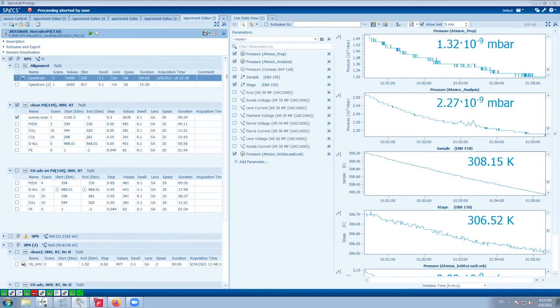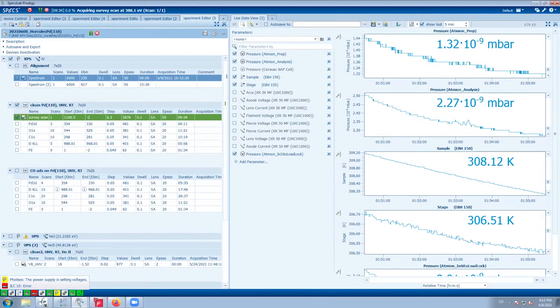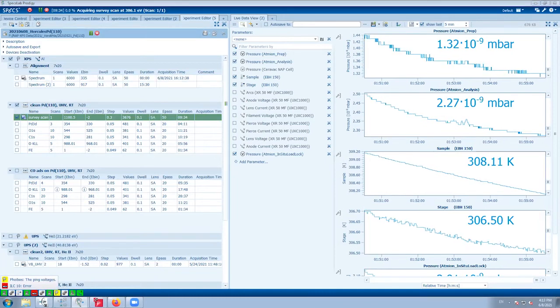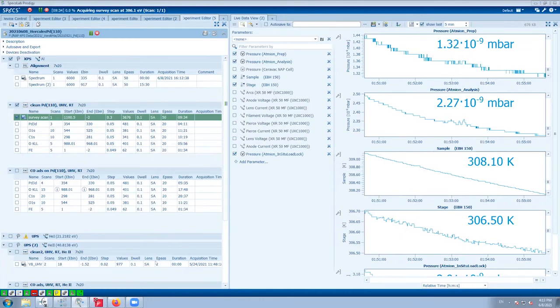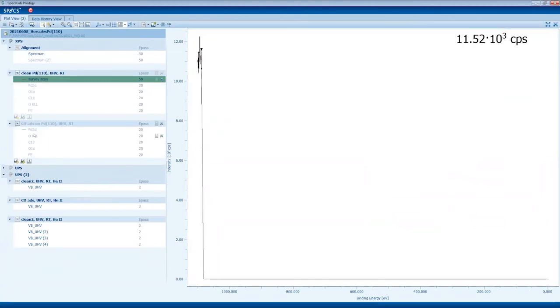We replaced the anode and looked at the old one under the microscope, and we saw a big hole, like a 1 millimeter crater, deep, completely ablated, I think. You don't have any more aluminum, so no aluminum light. So now we work at 25 watts or 40 watts. We still have quite good signal. So Brett finished this alignment.